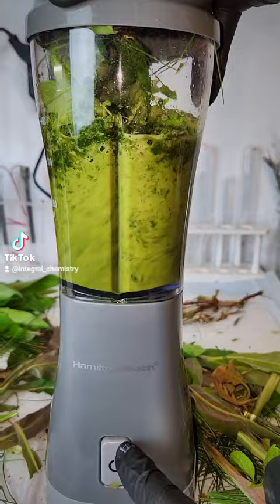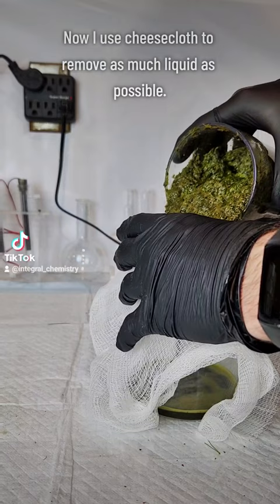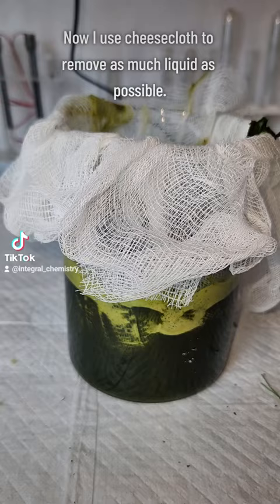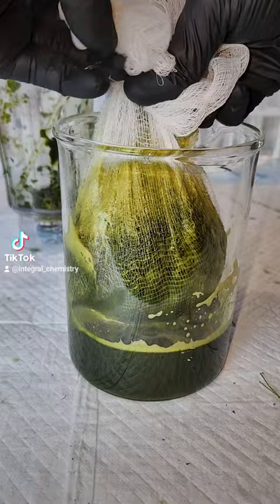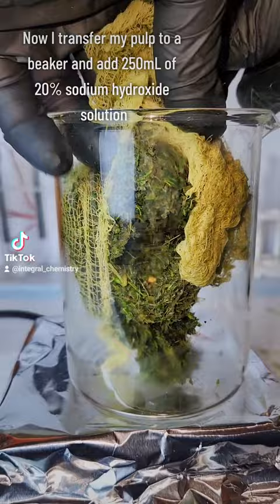I basically just made a big tea bag and squeezed as much water out as I could. The plant debris left behind at this point is a mixture of cellulose as well as secondary polymers and copolymers that help act as structural material for the plant. These aren't cellulose, so I don't want them, and my next step is going to be to destroy them using alkaline hydrolysis. The alkaline hydrolysis is conducted by mixing my plant pulp with a 20% sodium hydroxide solution, which will hydrolyze and destroy the secondary polymers and copolymers.